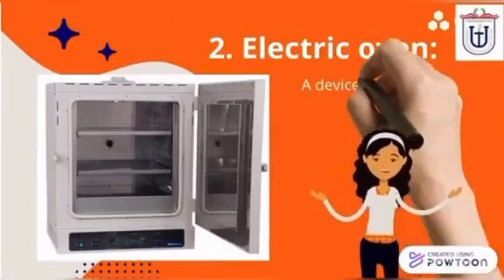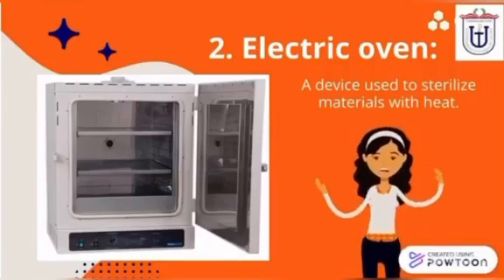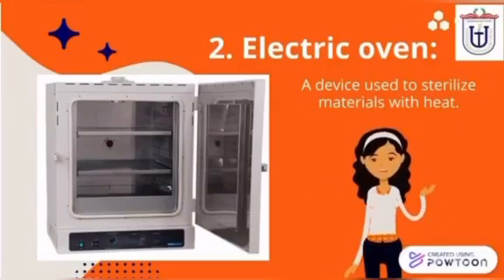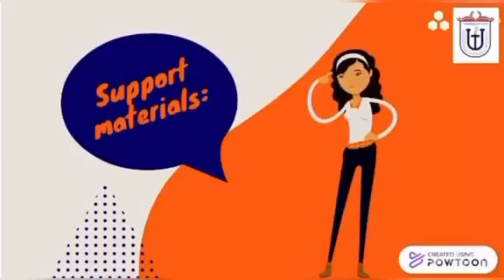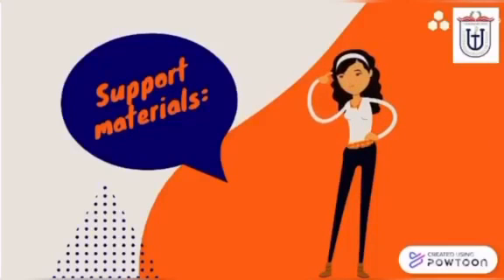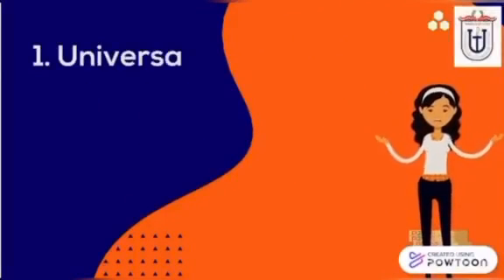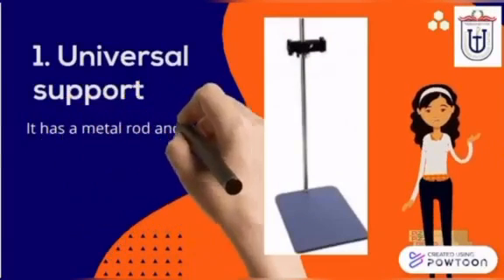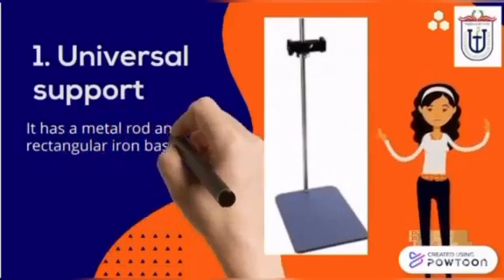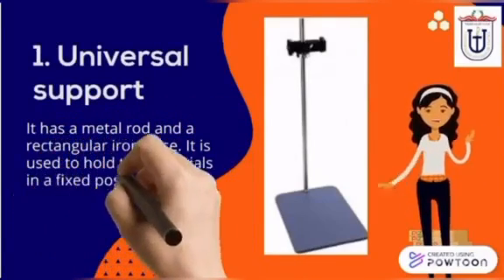2. Electric oven. A device used to sterilize materials with heat. Now we are going to see the support materials. 1. Universal support. It has a metal rod and a rectangular iron base. It's used to hold the materials in a fixed position.